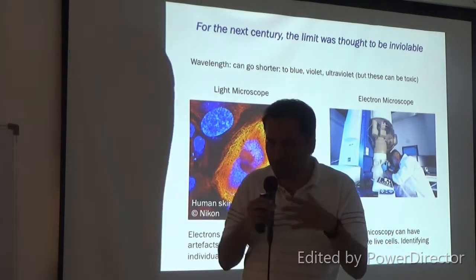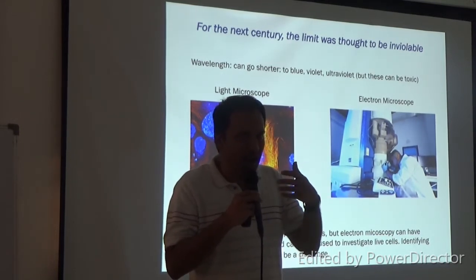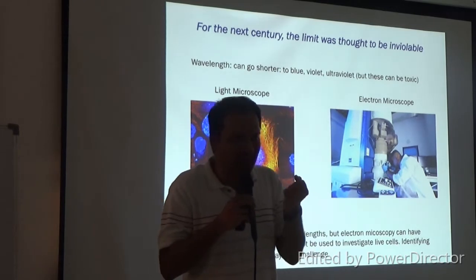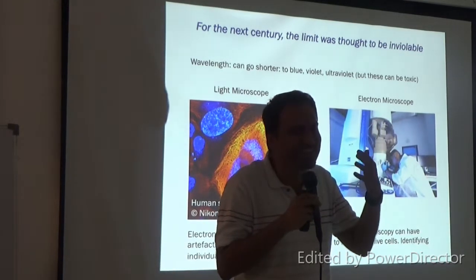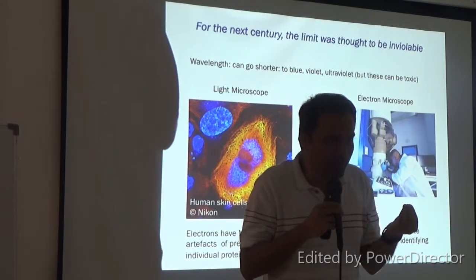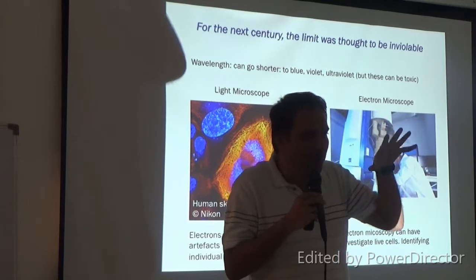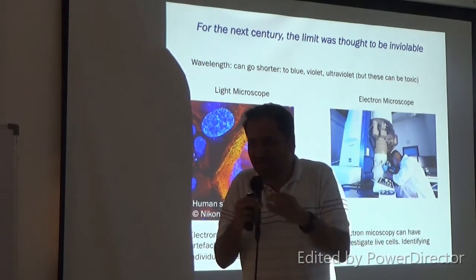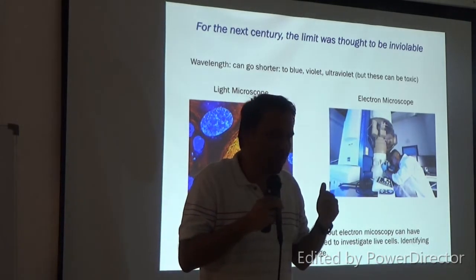And generally in Sawaal-Jawabs we tend to emphasize why the public should care about this, but for microscopy it's hard to do because for almost any kind of biology, any disease you think of, our fundamental understanding has come from light microscopy. Take any disease. At the molecular level, what is happening? If you say cancer, that's because of DNA damage, right? How do we know more about that? We will know by imaging the cells with light microscopy. So I don't have to motivate it with one particular disease. For any human disease, the molecular understanding will require microscopy, and oftentimes light microscopy.